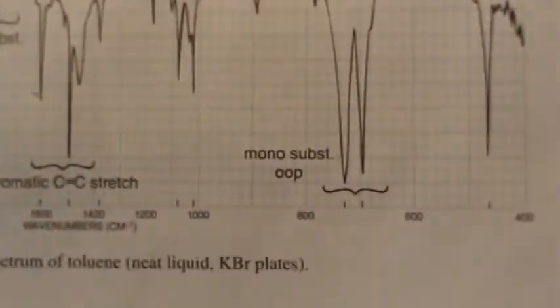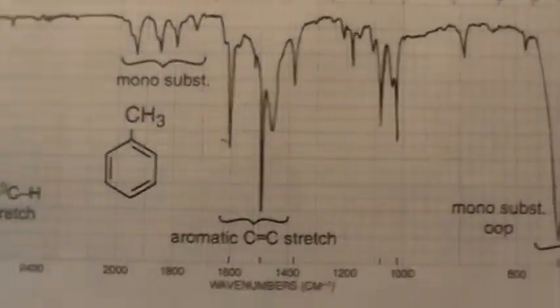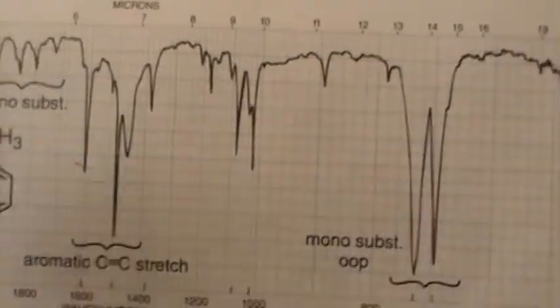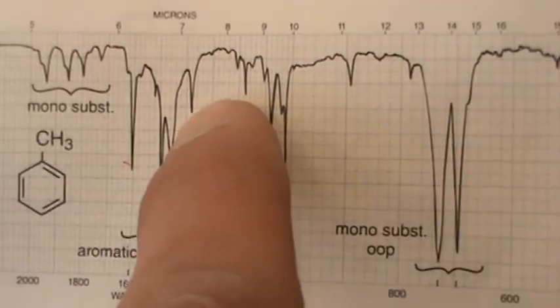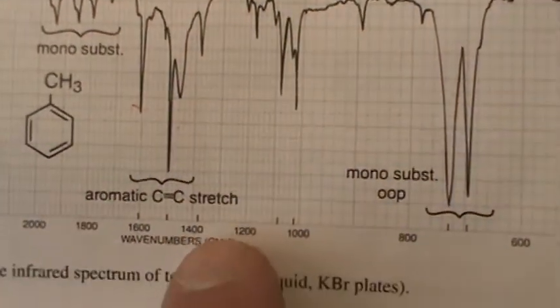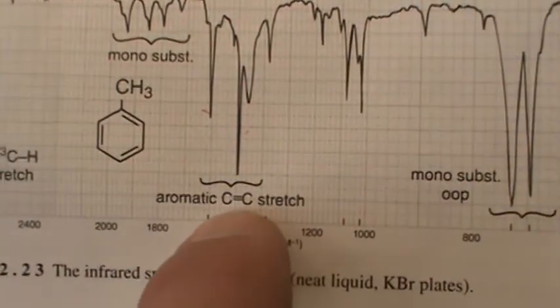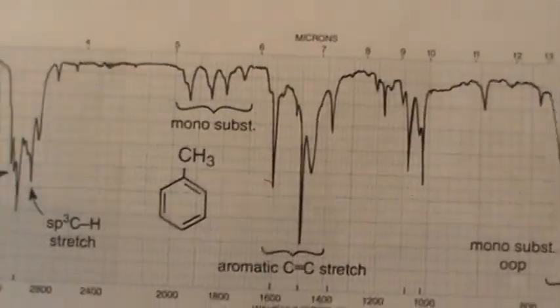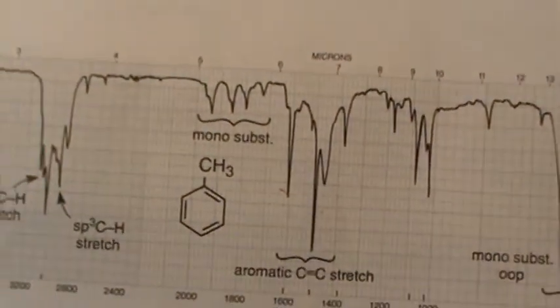Look at this one. This is an aromatic example section. Here is toluene, which absolutely does have a methyl group on it. But you can see how he didn't bother. See that one right there? Or potentially that one? Right in that 13 to 1400. See how he's got these three as being a C double bond C stretch, but he did not label those ones. It's a classic case, folks, where this region, nobody normally likes to label stuff in there unless they're absolutely sure.